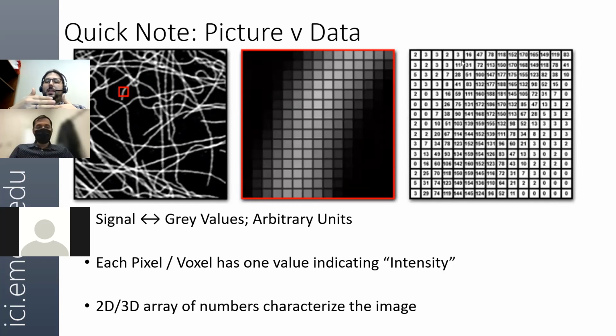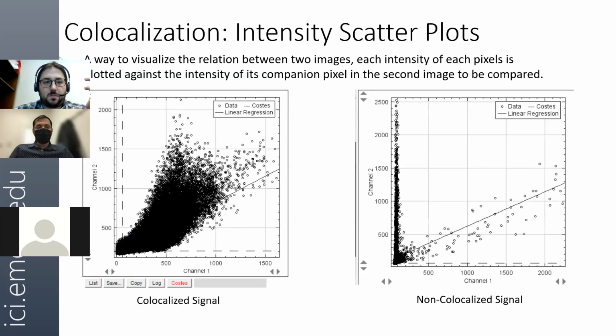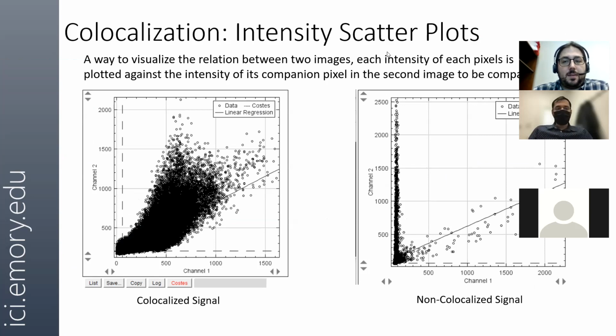Here, you would start to compare the two pixel by pixel from the start in the same way for each image. Does that make sense to people? Does anyone have questions about that? Okay.